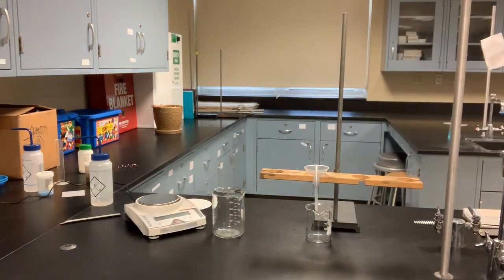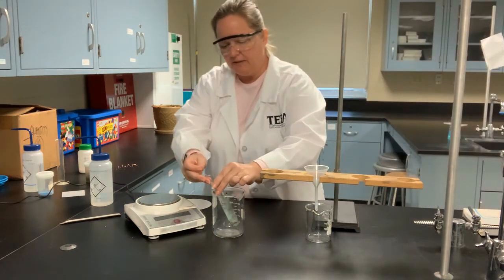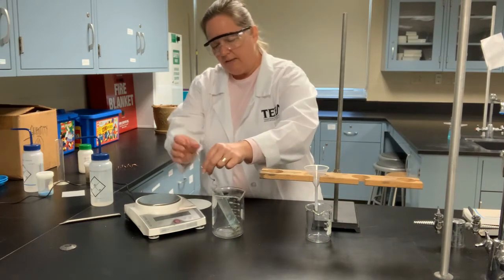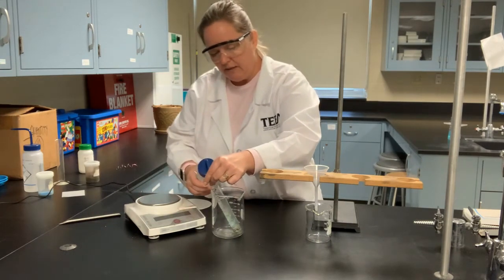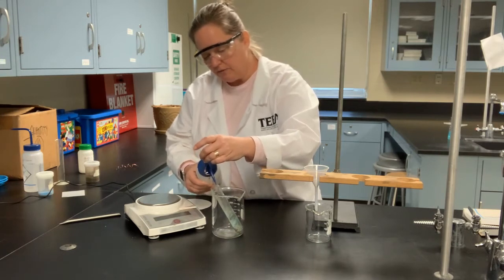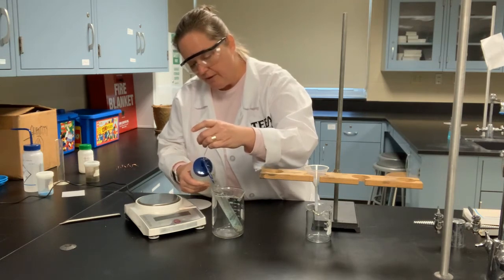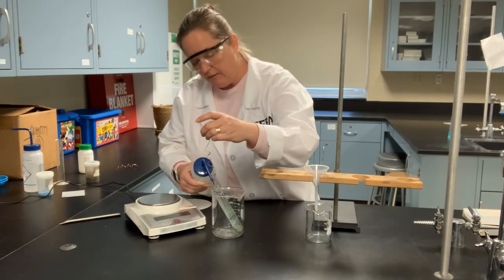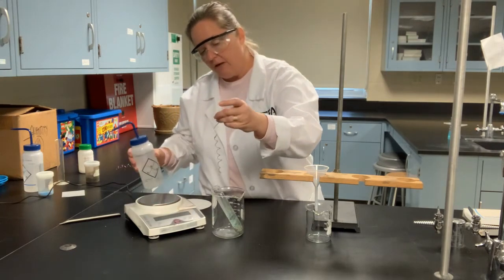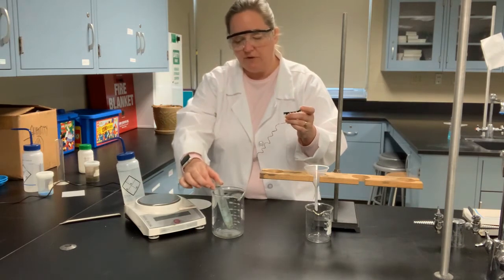And I'm going to walk back around because the next step I want to do is I need an extra set of hands, which is the purpose of my beaker here. I'm going to raise my coil up a little bit, and I'm going to use my deionized water bottle to kind of hose off my coil and knock any silver crystals that remain attached to the coil back into the solution, being mindful that I've got to watch my total amount of solution here so I don't overflow my test tube.